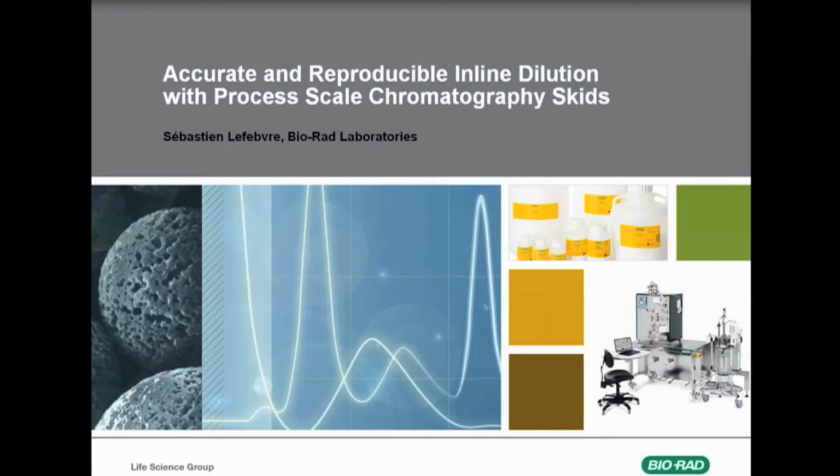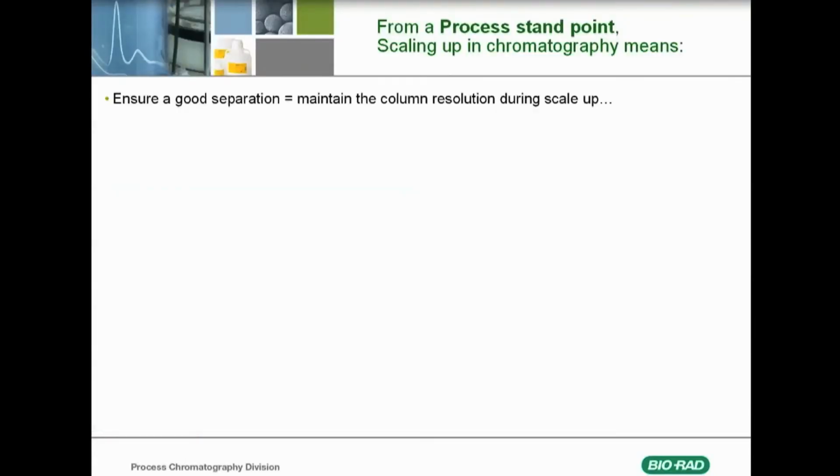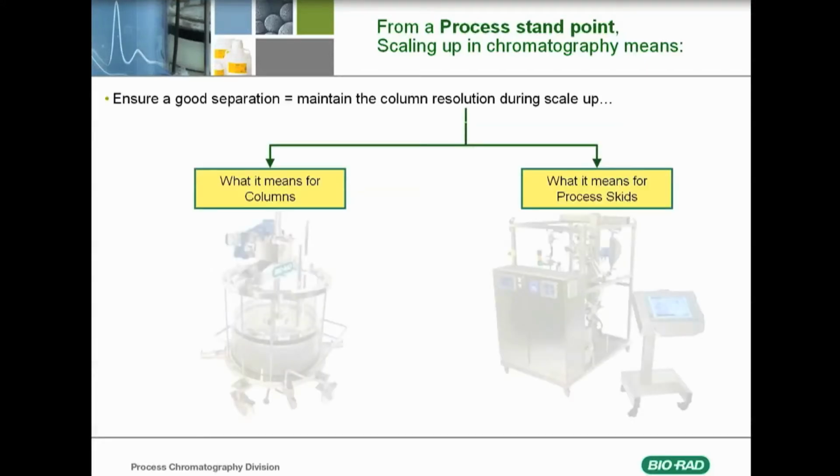Thank you very much, Herbert, and I'm very excited to be with all of you today. Before entering directly into the subject of inline dilution, I would like to step back a little bit about the general picture of process chromatography. Process chromatography is all about separation, and therefore to maintain resolution between the target molecules and all the other molecules, contaminants or other. So now, how does it translate in terms of hardware?